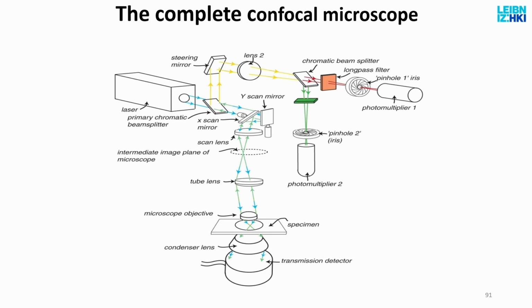If I go back here for a second, descanning simply means that the emitted photons are also going through the same scanning mirrors that the excitation photons do. This means that whatever movement the mirror forced on the excitation will be forced inversely on the emitted light, which will mean that the emitted light will not move. It's good because otherwise you have to chase it.